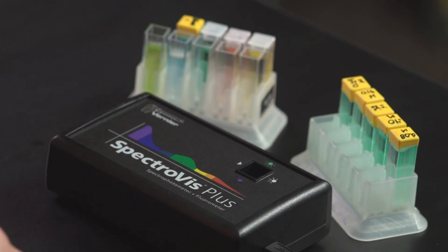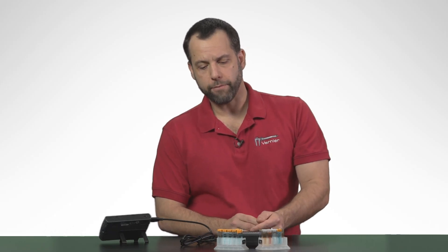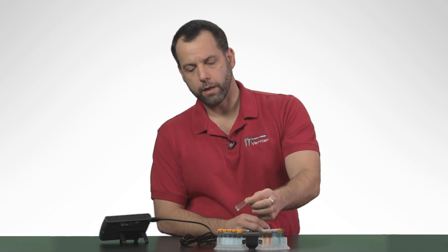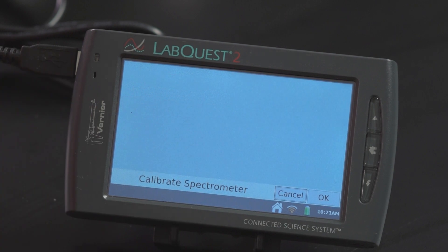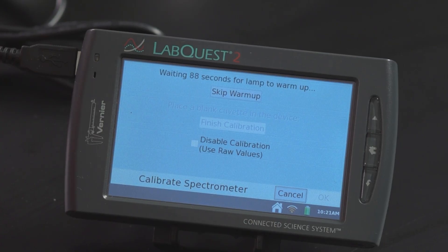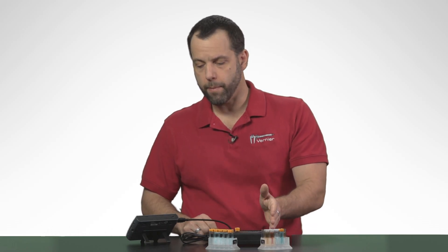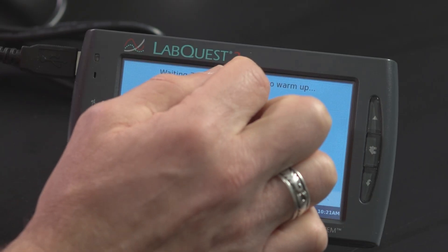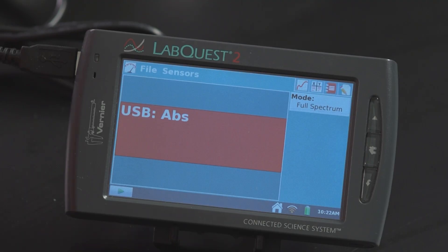To calibrate it, I'm going to use a sample of water. Absorbance is a unitless measure, so we're actually looking at the amount of light that travels through some type of solution relative to our blank. In this case, my blank is water. So we'll calibrate the device — I can just tap on the meter screen and select calibrate. Now normally most spectrometers take 10 to 15 minutes to warm up, but this spectrometer only needs 90 seconds to warm up from when it's plugged in. I've been talking for over 90 seconds, so I can actually skip the warm-up. I'm going to calibrate the device, and most importantly, I'm leaving my blank in here. Then I hit the OK button, and now I'm ready to look at a sample.